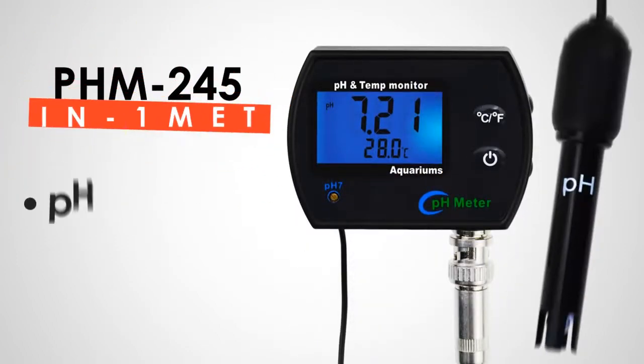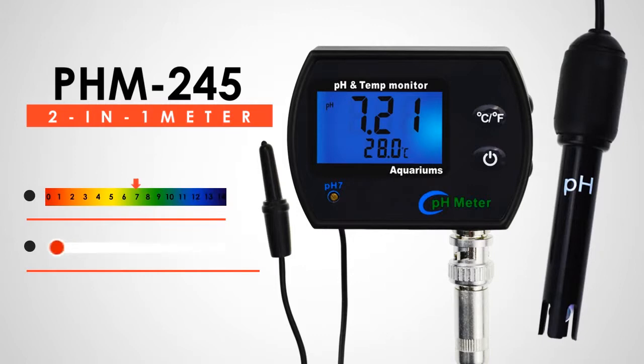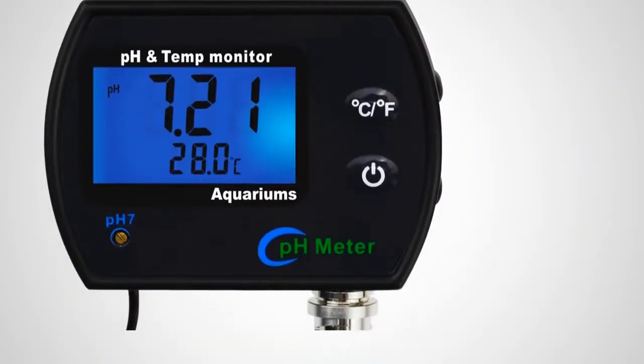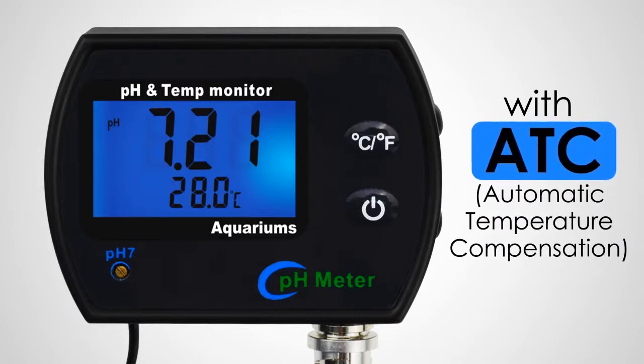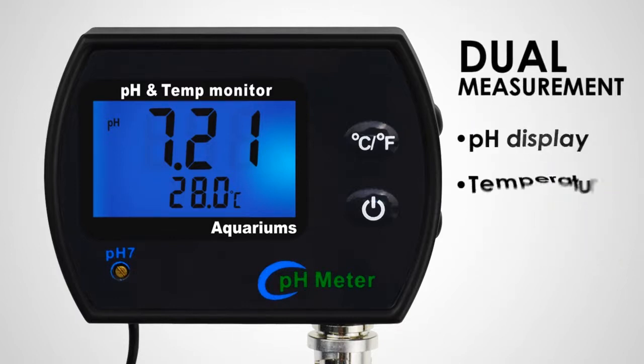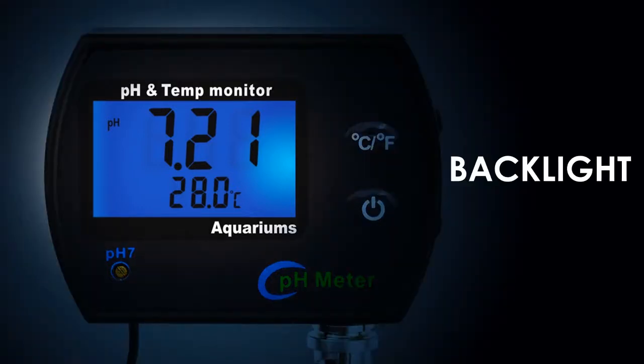PHM-245 is a two-in-one combo pH and temperature meter that can help you monitor and measure the pH level and temperature of a solution. This meter is equipped with automatic temperature compensation that provides high accuracy. It is dual measurement that displays simultaneously, and its backlight is perfect to use in a dark environment.